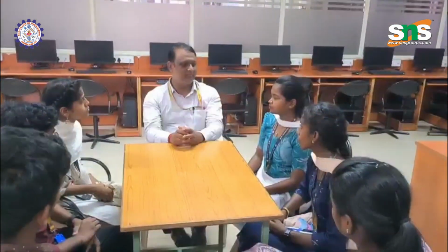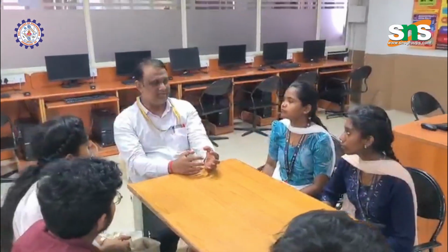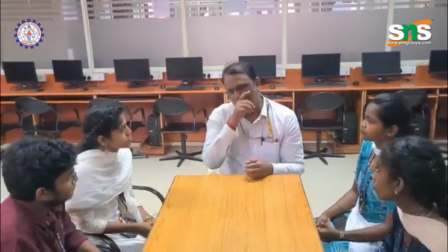Usually in laboratory or in any theoretical experiments, we do some reactions that are basically based on traditional volumetric analysis. But in volumetric analysis, there exist some demerits. So we can go for some other technique like conductometric titration instead of the volumetric one. So our job here is to discuss the design thinking aspect of conductometric titration.